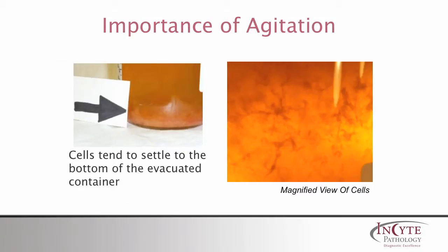Now we are ready to aliquot the sample of pleural fluid or ascites cytology specimen. By aliquot, we mean pouring off a representative portion of the fluid into labeled containers. Because the cells are heavier, they have a tendency to settle in the bottom of the container. It is important to shake the bottle sufficiently enough to mix the cells evenly. This will ensure the adequacy of the sample.